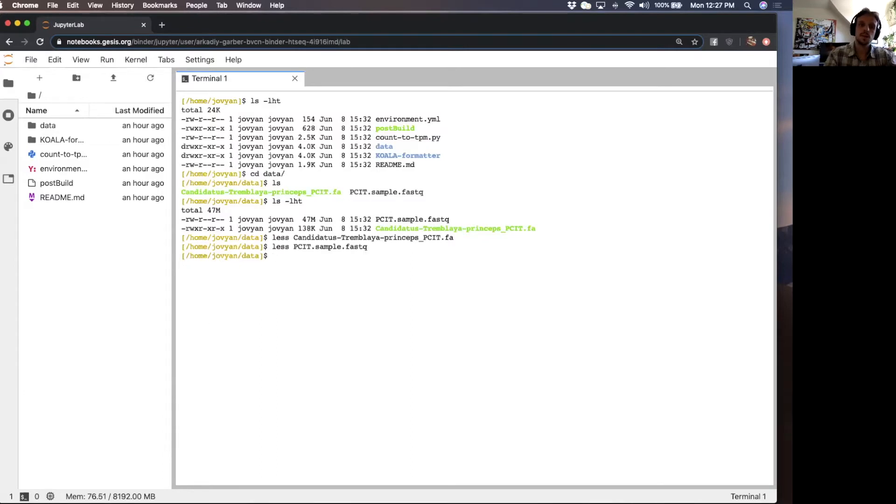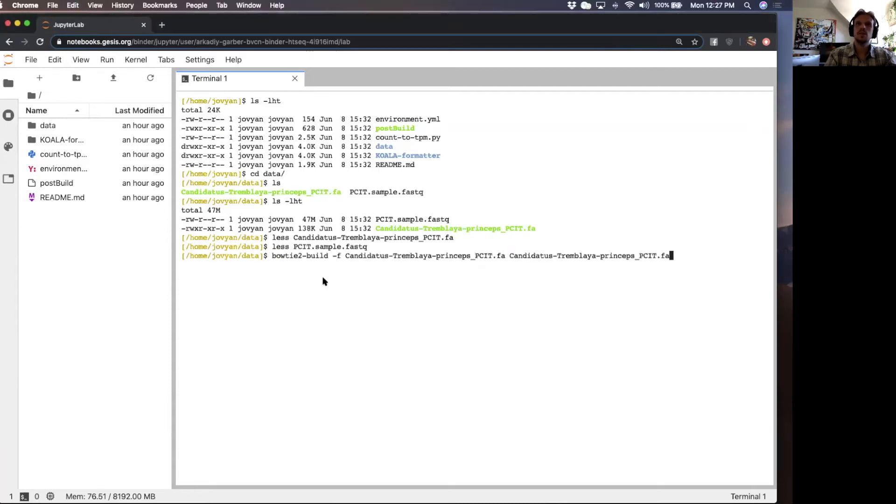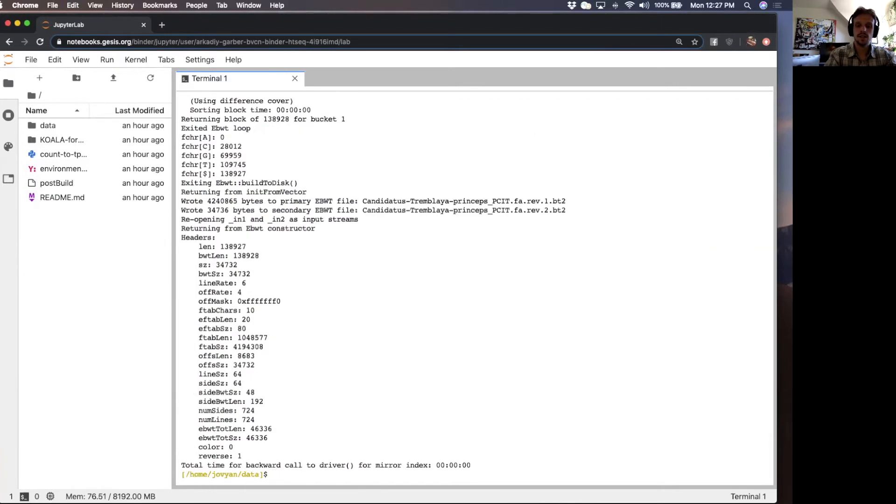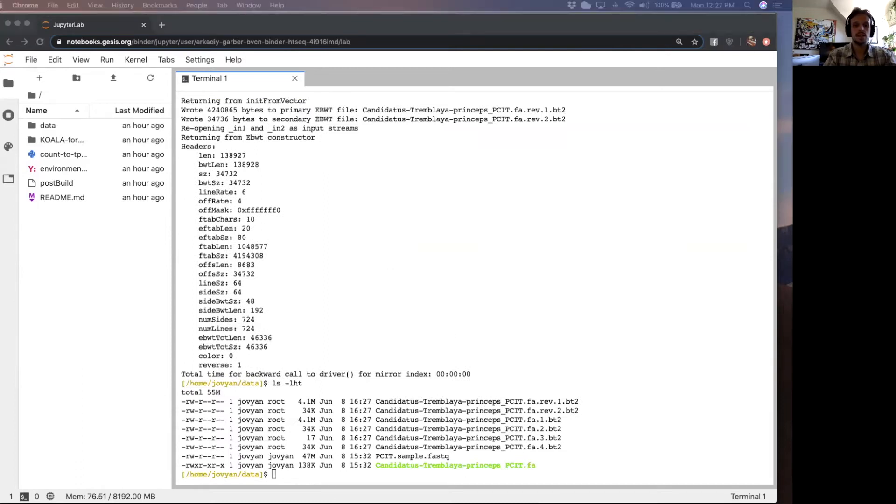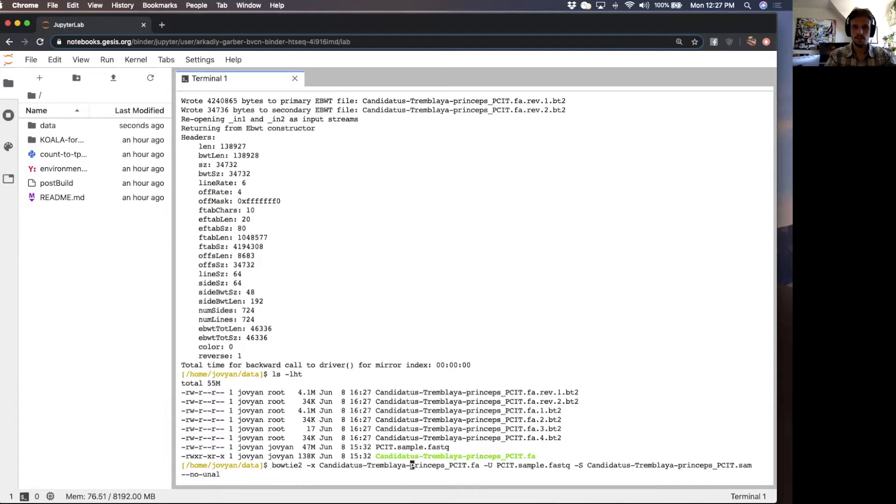Let's copy and paste the command from the walkthrough. We want to build the Bowtie database out of the genome. It's going to take a second. We'll see that we have a couple of files here. And then we're going to run Bowtie. Bowtie is basically going to map the reads back to the genome.